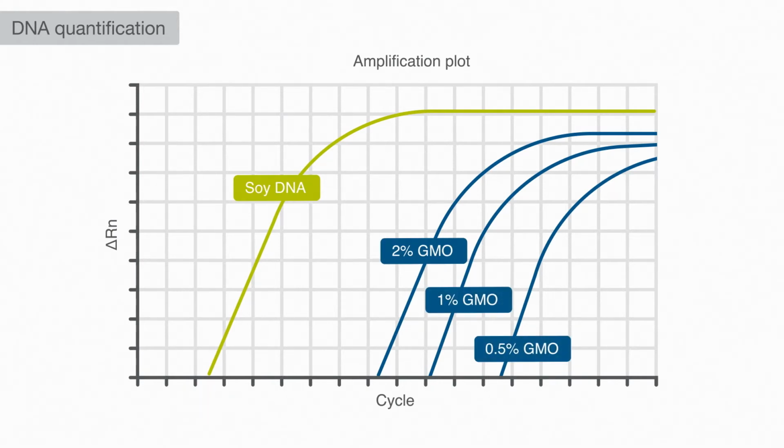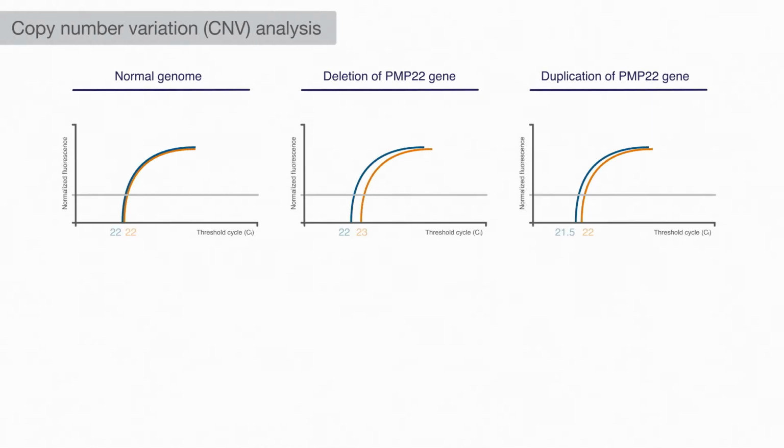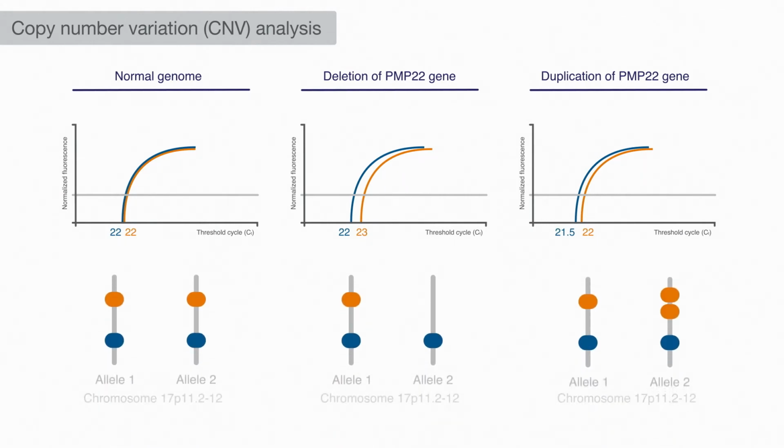they meet legal standards. Copy number studies on genomic DNA targets are quite important to labs that typically need to either segregate animals with different copy numbers of a transgene or detect and quantify duplication or deletion events associated with a particular phenotype. Keep in mind, I've only mentioned some of the more common possibilities. The fact is, pretty much any application that requires quantifying nucleic acid targets can be done using real-time PCR.